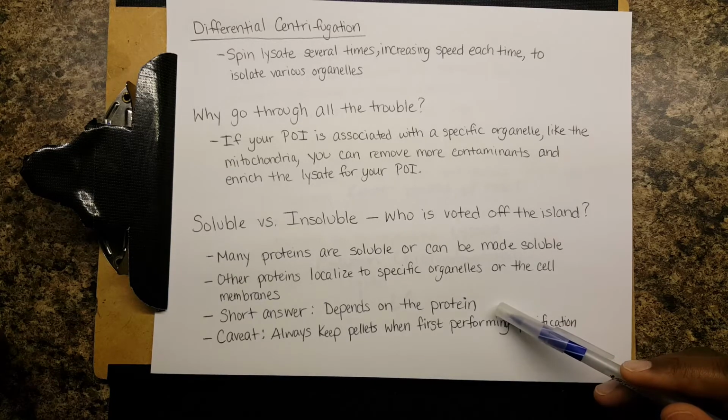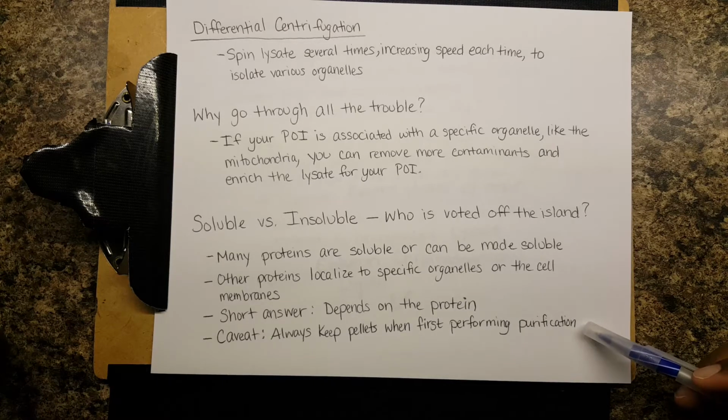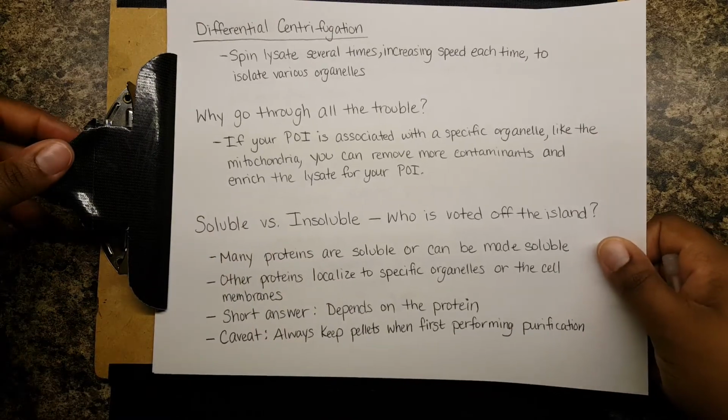So the short answer is it depends. The caveat is you should always keep everything when you're doing a purification. And that's just a practical tip. Until you are very comfortable and you've done this procedure many times with great results, do not get rid of anything until you are done and you have your protein and you've confirmed its identity. So just hoard everything until the end.